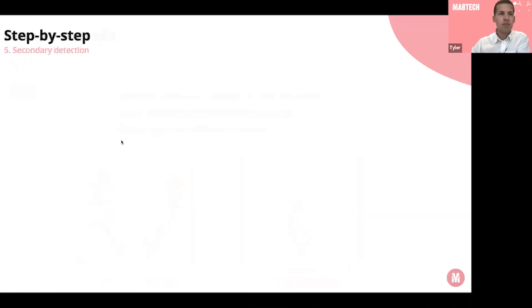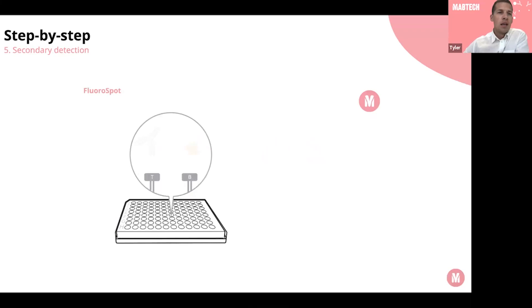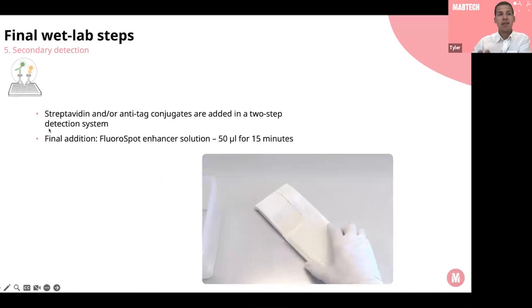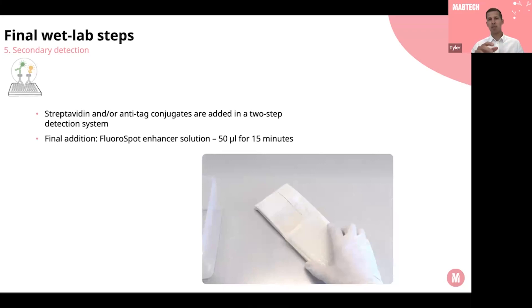After adding the detection antibodies, in a two-step system you then add the fluorophore-labeled secondary detection reagents — streptavidin or anti-tag conjugates. After that incubation period, remove those reagents and add the FluoroSpot enhancer solution — 50 microliters for 15 minutes — which really helps enhance the fluorescent signal. An important step: make sure to get all of the enhancer solution out. Do a hard decant into your waste bin, then hit the plate upside down against a stack of paper towels until you stop seeing droplets. Any remaining enhancer solution in the wells can negatively affect the data.